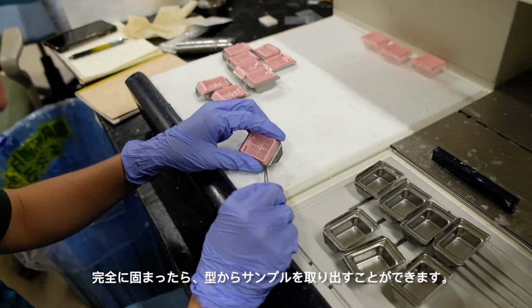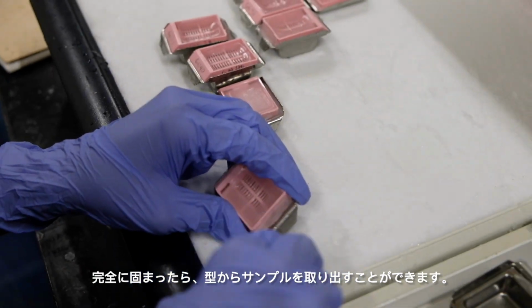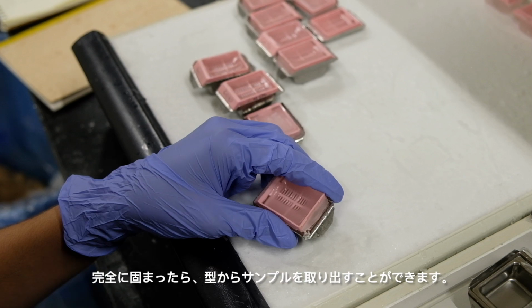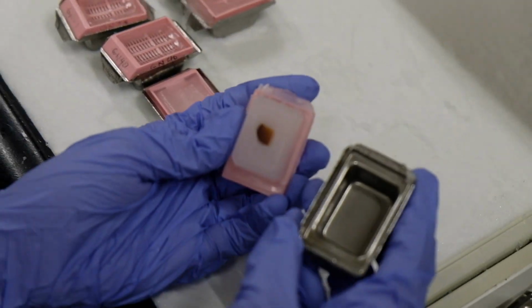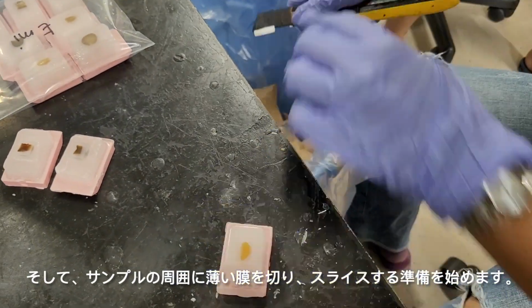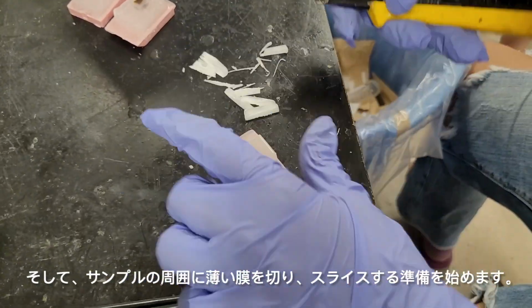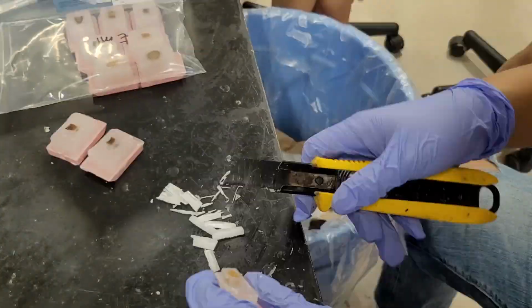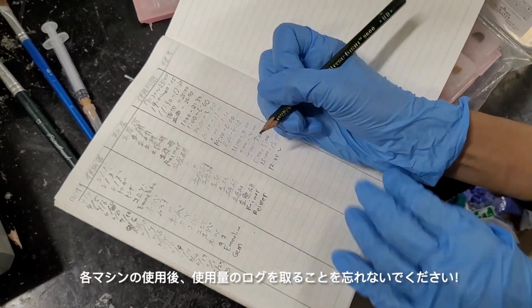Once it's solidified fully, we can help nudge and scoop the sample out, and it'll look something like this, and we can just put it back onto the cooling pad. Once we have our solid samples, we can then start to cut into it a little and create a thinner box around the tissue so that we can put it in the microtome. And again, don't forget to log your usage after each machine.